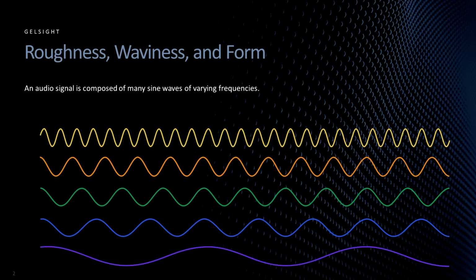In the audio world, these sine waves are typically described by their frequency. In the surface metrology world, we tend to think of these sine waves in terms of wavelengths. Perhaps you may recall from school that the frequency is simply the reciprocal of the wavelength. In other words, high frequency signals have short wavelengths and low frequency signals have long wavelengths.